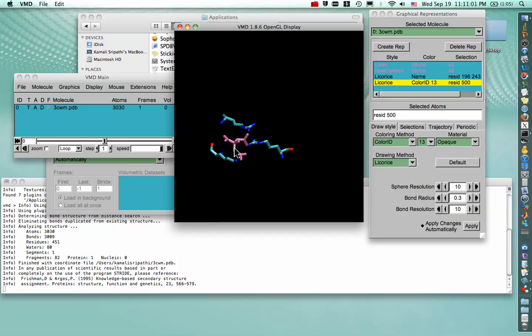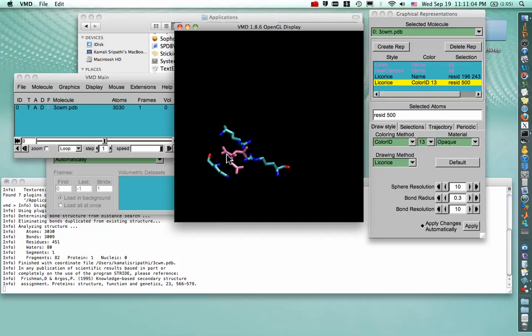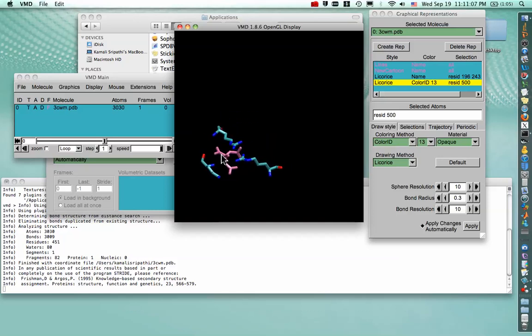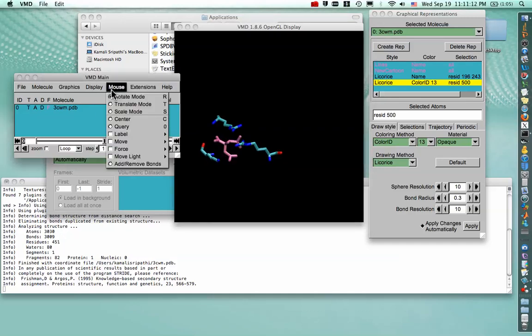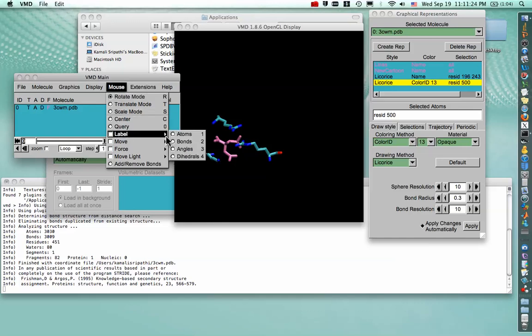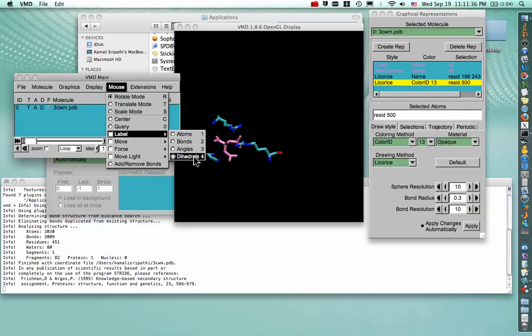And so just like the different mouse modes that we have, we also have different modes for measuring distances or angles. So to see those shortcuts, you go to the mouse submenu in the VMD main window, go to Label, and you can see that to label the atoms, you just press 1 while you're hovering the mouse over the window. Or to do bonds, you press 2 and angles 3. If you want to do dihedral, like the way you see in a Newman projection, you press 4.